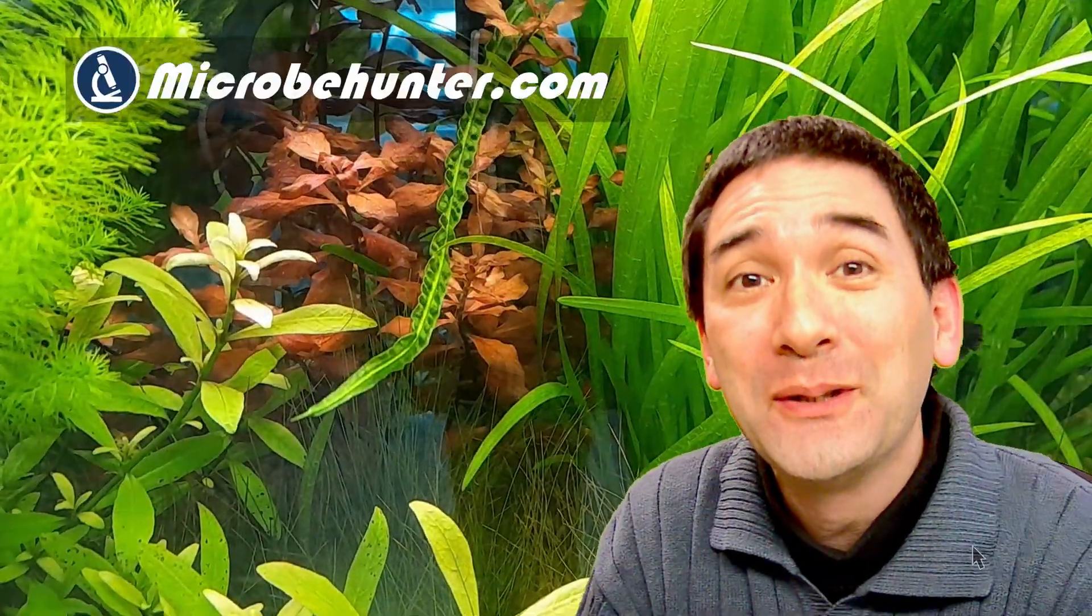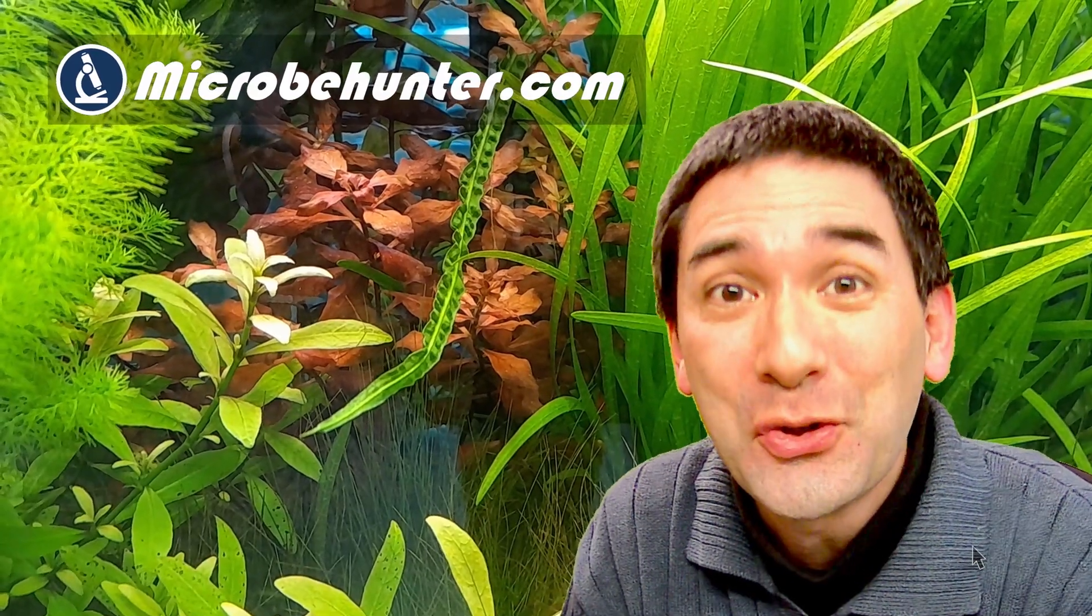So hi, hello and welcome. Microbe Hunter here and today I'm going to do a little bit of aquarium microscopy.